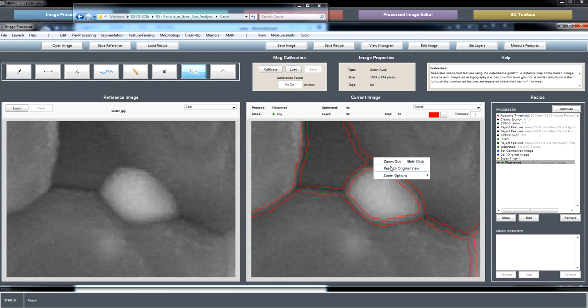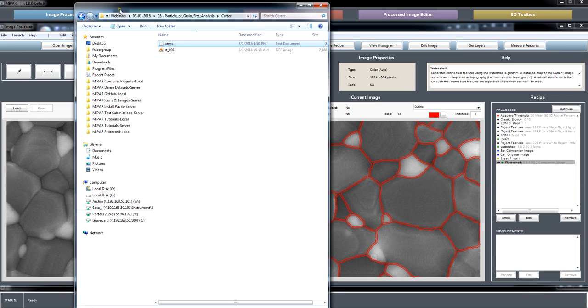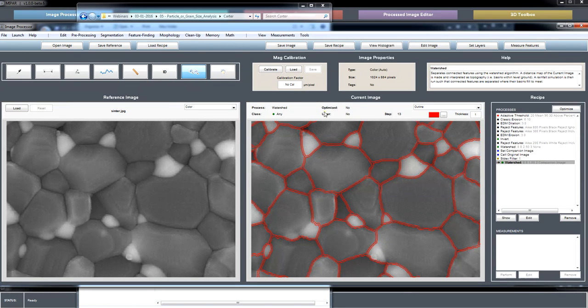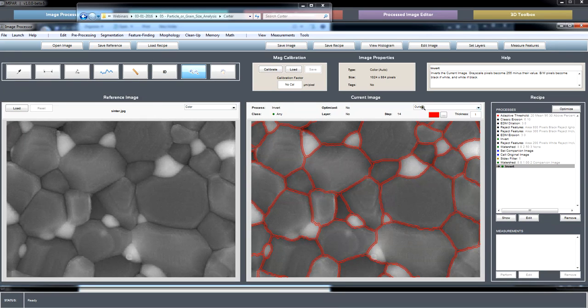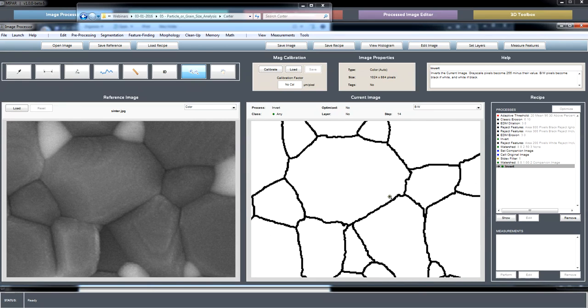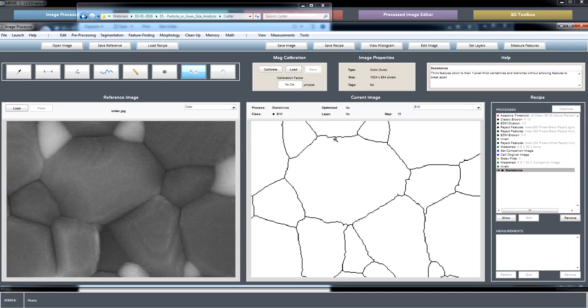Now you can also skeletonize this end result, since skeletonization is done with some mathematics I don't quite understand that is preserving Euler numbers and so on. So you can skeletonize this final boundary map if you wanted to, and it would give you something that is slightly different.